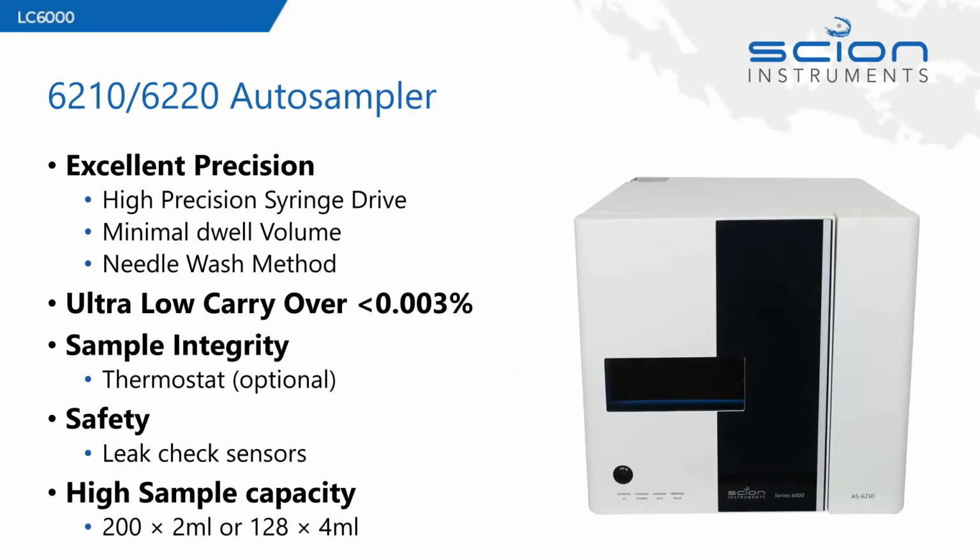In terms of the autosampler, as I've said, we have two variants, that is the 6210 or the 6220. The only difference between the two is having that thermostat option. So as I said for GC, if you need sample integrity because your samples are susceptible to degradation, then we apply the thermostat option. It can cool right down to 4 degrees centigrade, and it can maintain the temperature to 5 degrees below ambient temperature too.